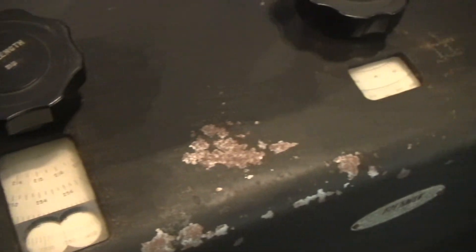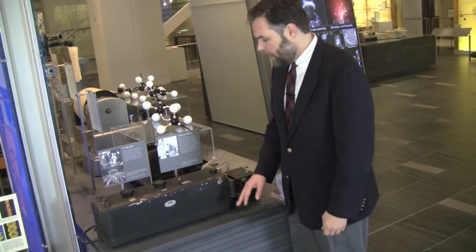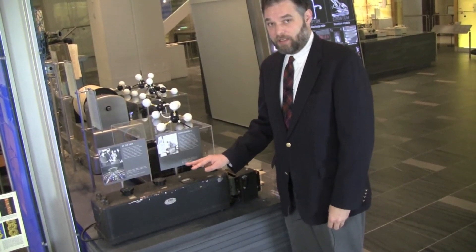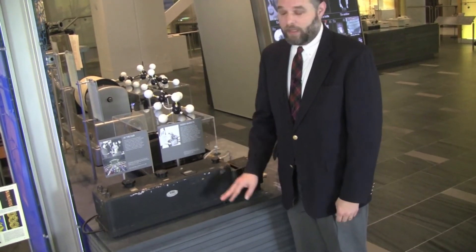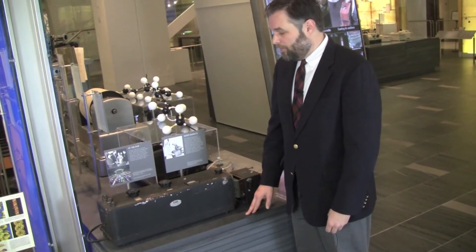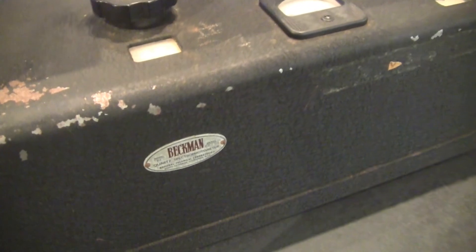Introduced in the early 1940s, this electronic instrument basically used electronic detection of these absorption lines and really speeded chemists' ability to detect these characteristic fingerprints with greater accuracy and speed. It was a blockbuster hit in terms of an instrument — very popular, very much helping to usher in this new era where electronics-powered instruments helped to transform the practice of chemistry.